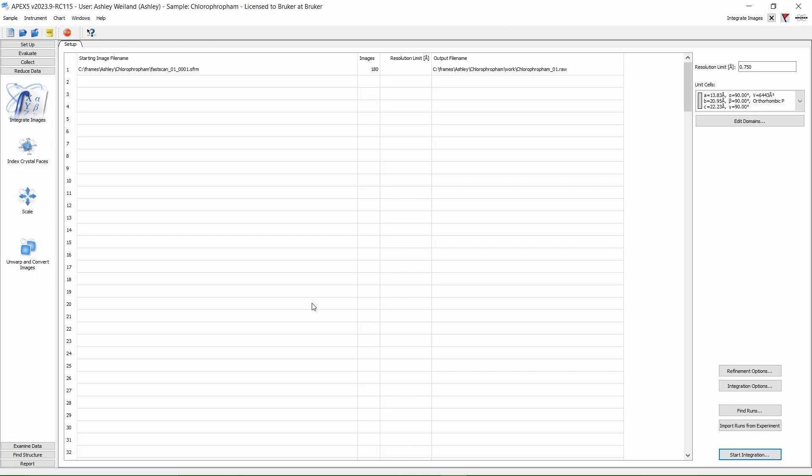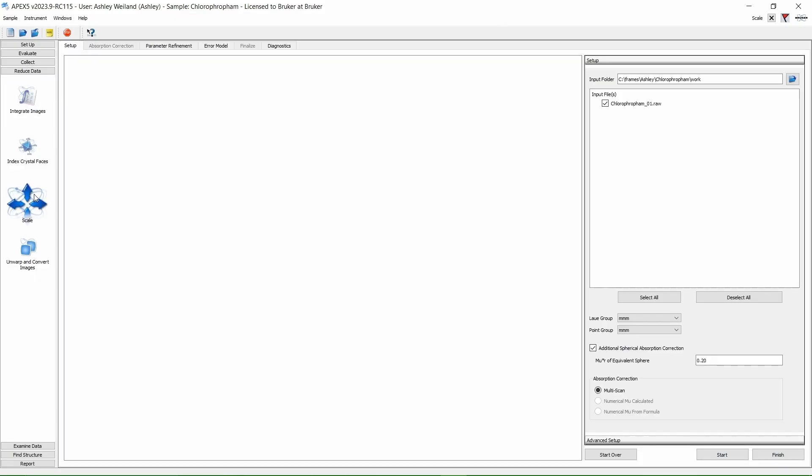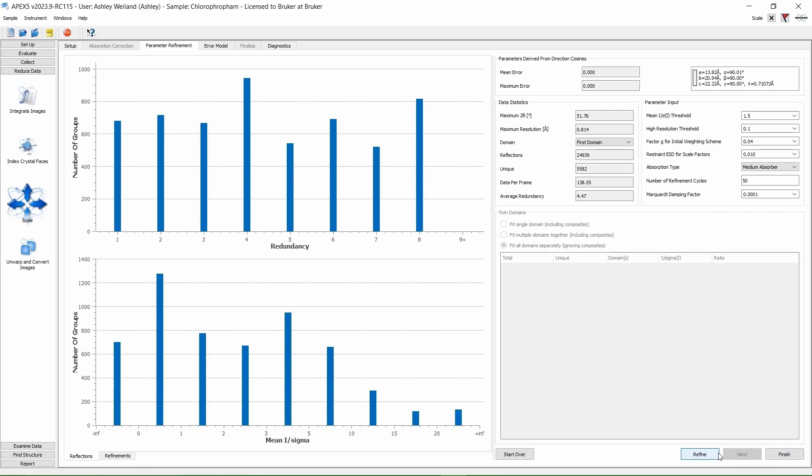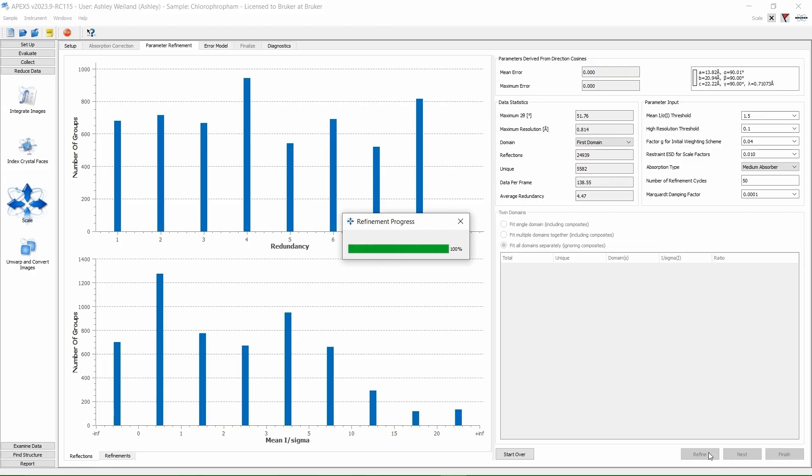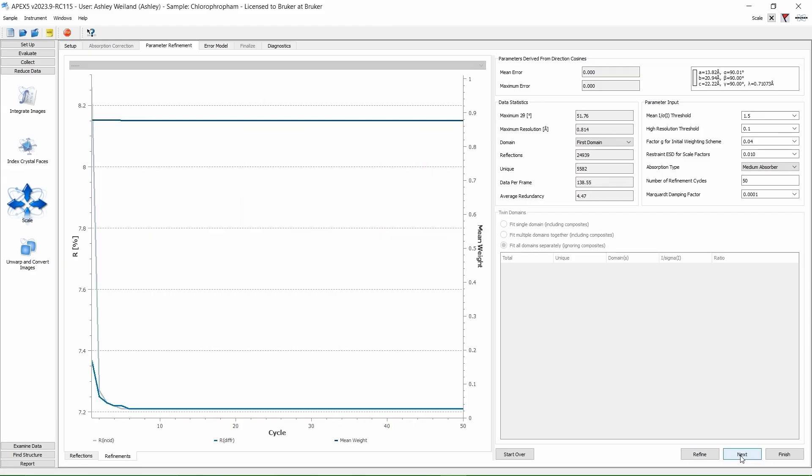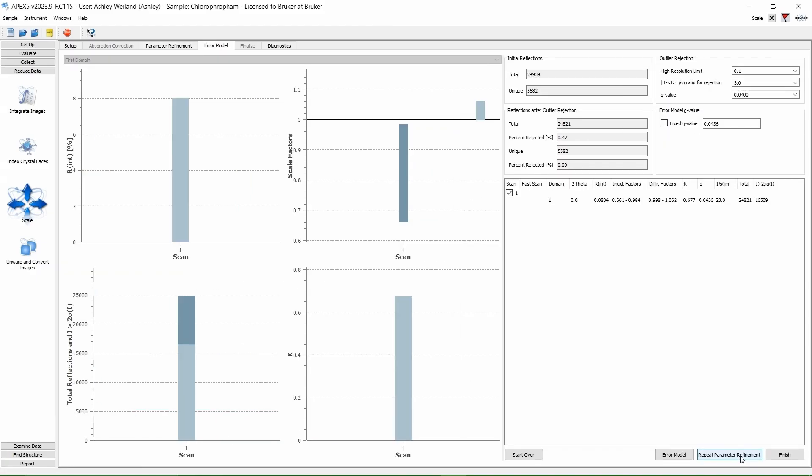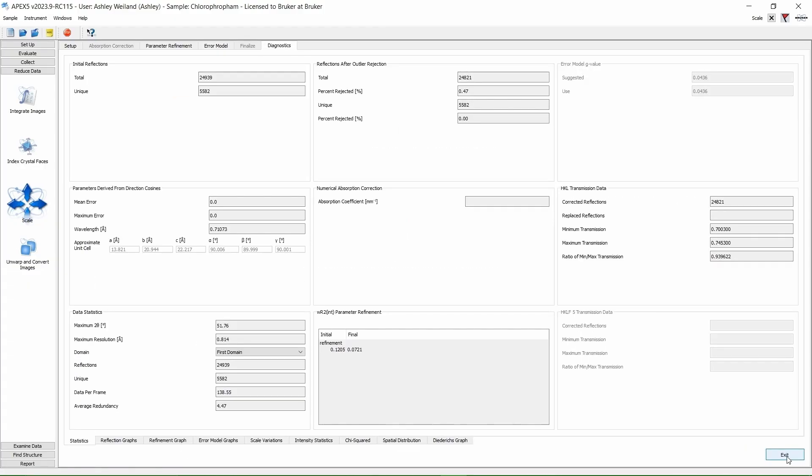Then click on Scale. Our integrated .raw file is automatically read in for us. Click Start. Now click Refine. Now that scaling is done, click Exit.